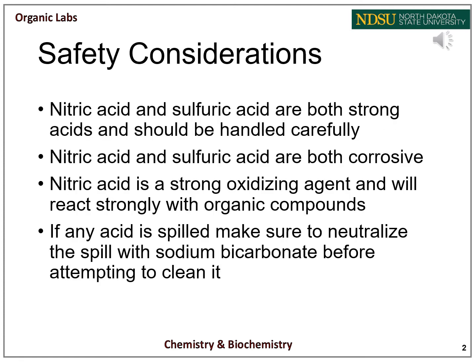Before we begin, some brief safety considerations. Nitric acid and sulfuric acid are both strong acids and should be handled carefully. Both acids are also corrosive and will burn you if left on your skin. Make sure to wash any affected areas with copious amounts of water if any gets on your skin.